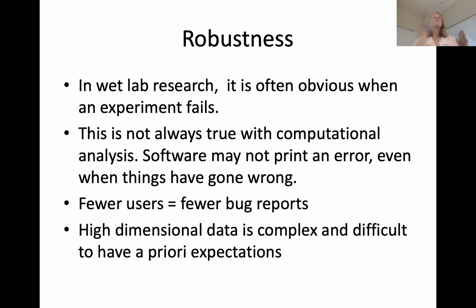You have to go look at that log and think about whether this makes sense. I've got a whole bunch of samples. They all match the peach genome, great. And then I've got a sample that maps at like 0.5%. So it takes actually looking at your data and thinking about it.